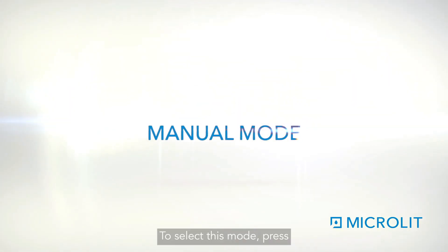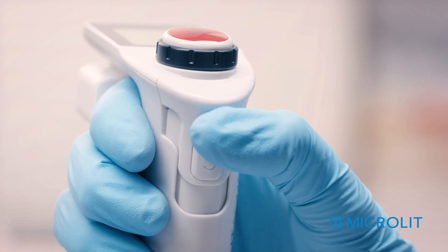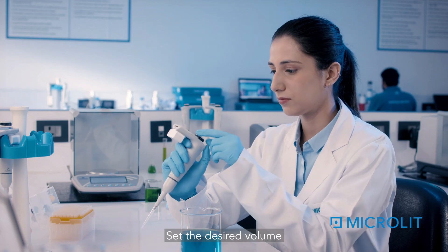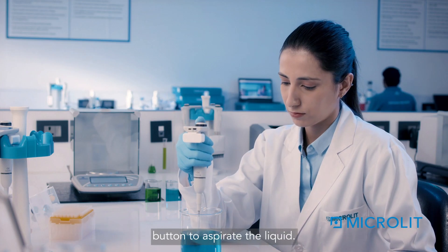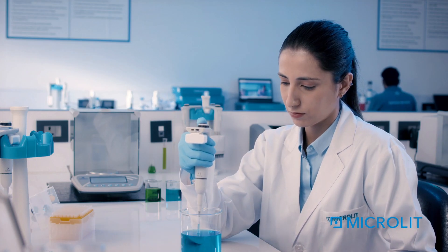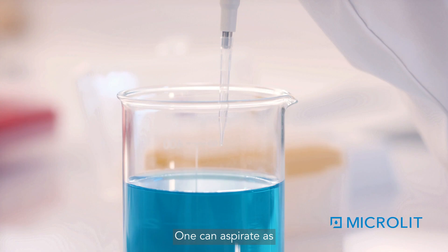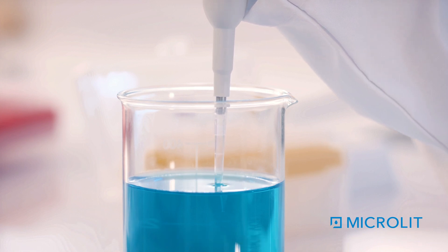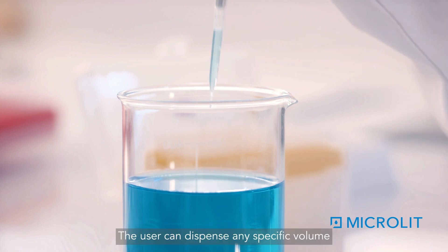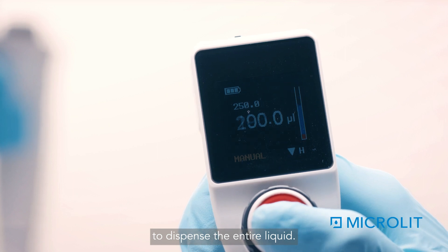Manual Mode: to select this mode, press the function button once. Set the desired volume using the volume adjustment wheel, then long-press the plunger button to aspirate the liquid — the aspirate indicator will be displayed. The user can aspirate and then dispense any specific volume as per their requirement.